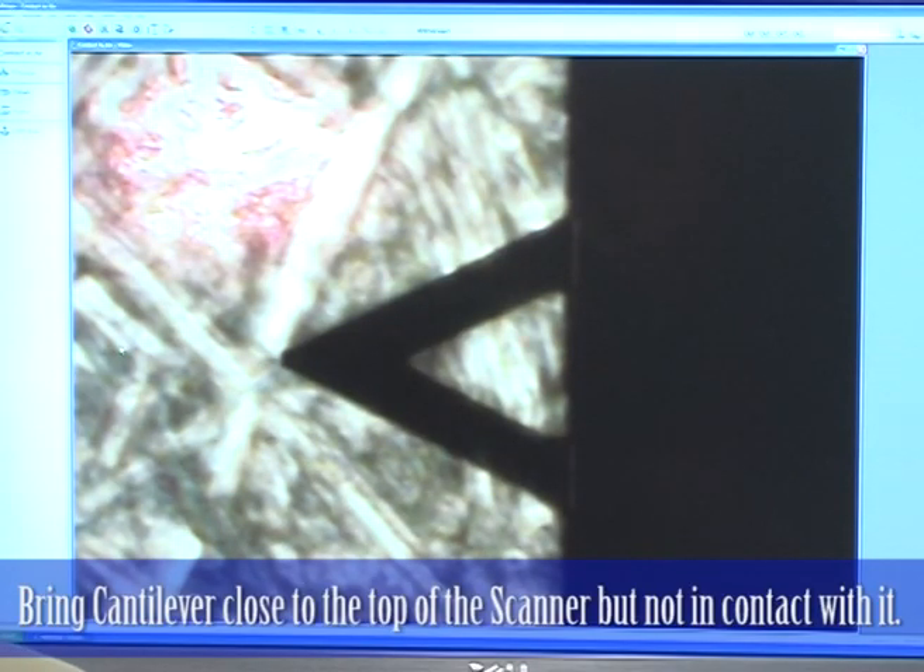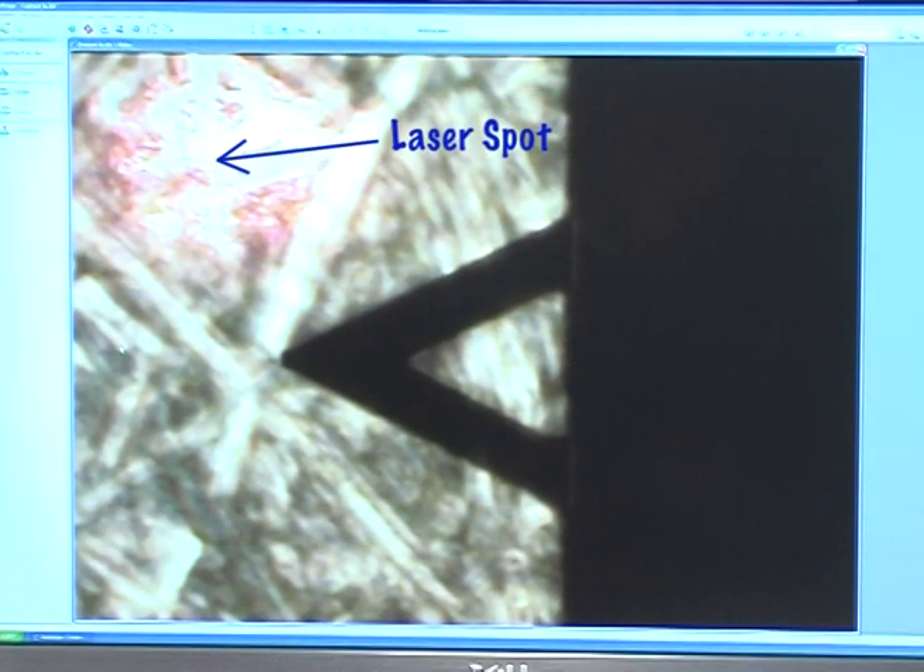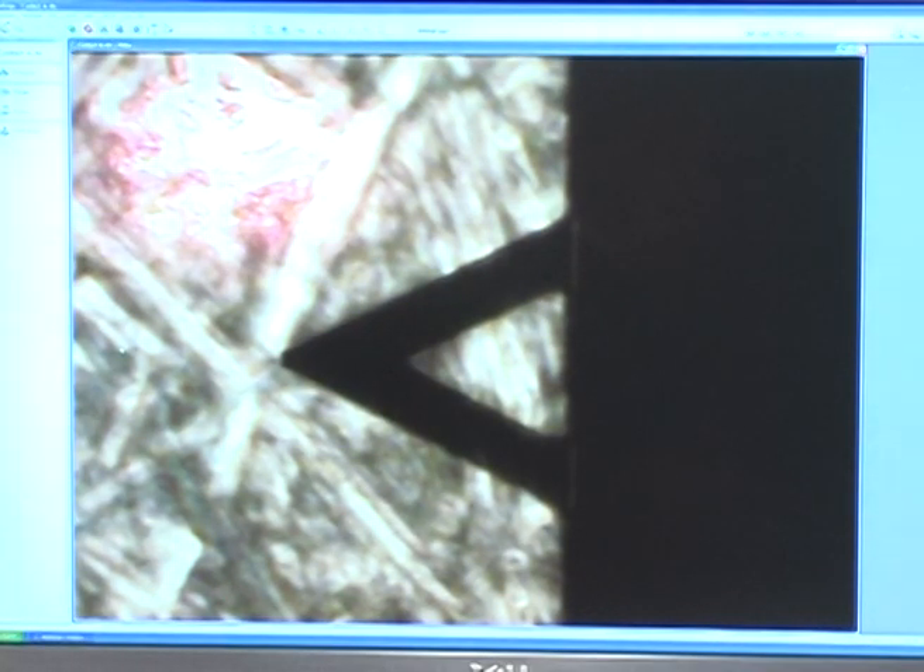I've brought the cantilever close to the top of the scanner, but not in contact, but quite close so I can see the laser spot on top of the scanner. You'll have to do some sort of large movements of the laser to get it onto the back of the cantilever.